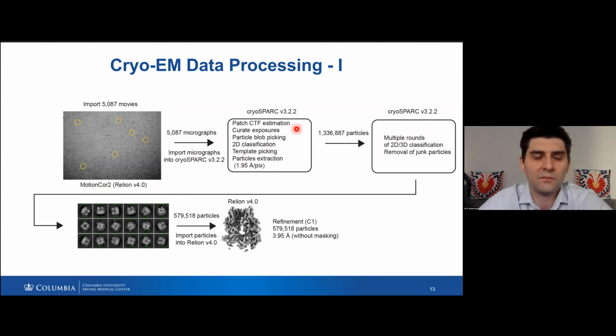I do the CTF estimation, blob picking, 2D classification to create templates, and template picking works perfectly fine for this protein, and I extract particles.